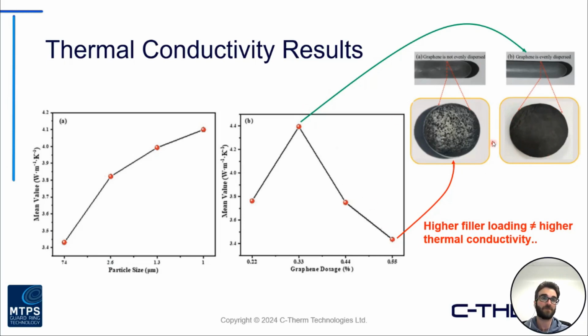As you increase that further, something was going on causing it to agglomerate, chunk together, what have you, but ultimately resulted in a detrimental effect to the thermal conductivity. So I just wanted to close out with that, as it really illustrates why quantifying your filler organization within the sample can be very important, and making sure you are getting the best possible output for your intended application.